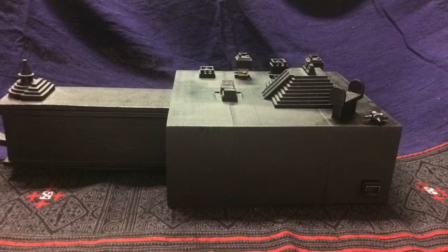With Xiuhtecuhtli nested inside Chantico, we come to the fluorescence spectroscopy part of my project. In this configuration, users gain the capability of detecting petroleum oil in samples of water and soil. But let's take a journey inside to see from the spectrometer's perspective.